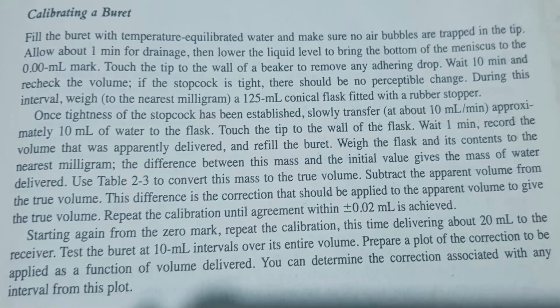Now, once the tightness of the stopcock has been established, we transfer from our burette approximately 10 ml of water into the flask that we weighed.